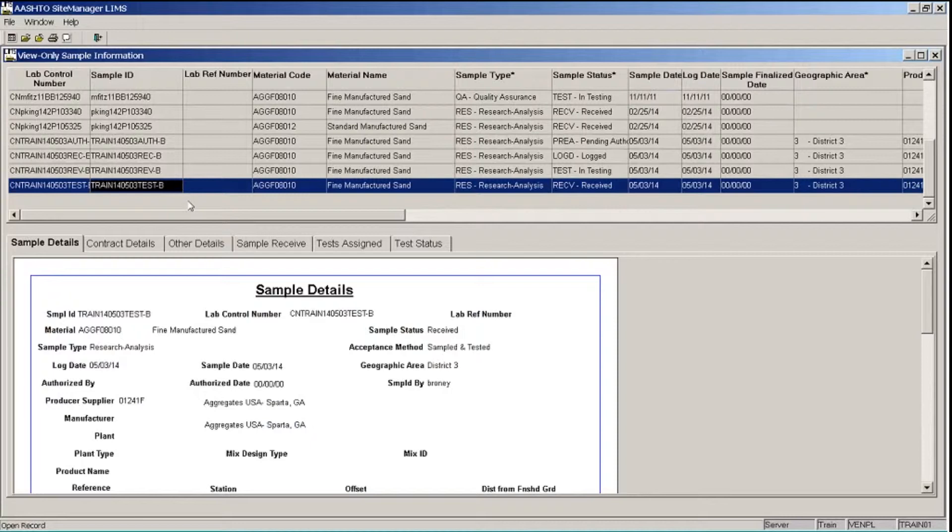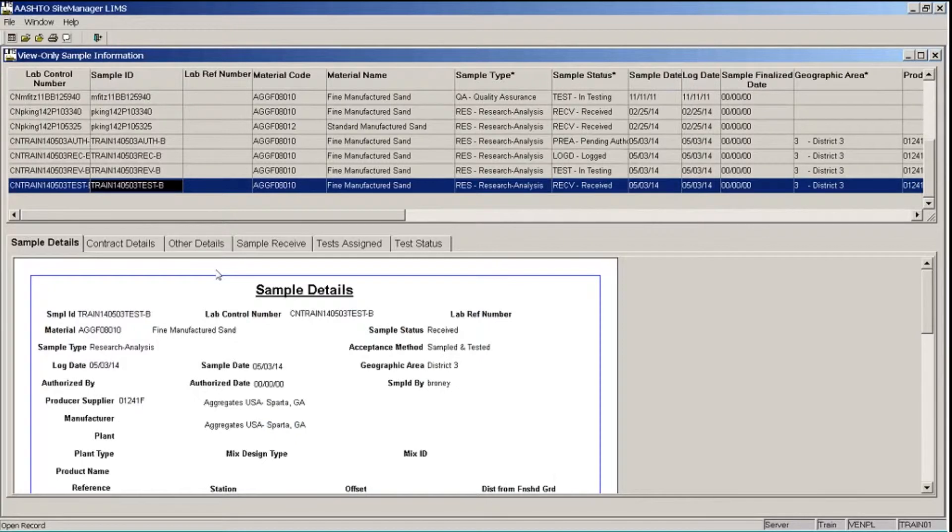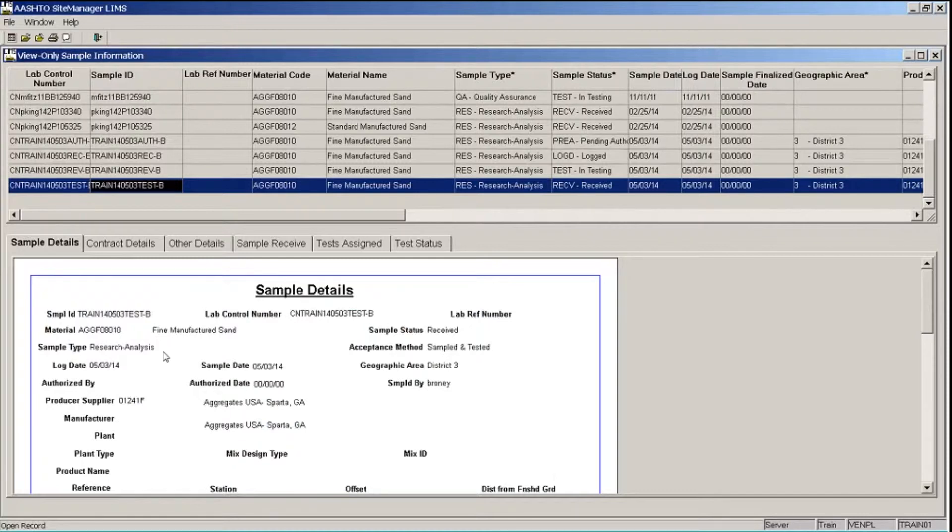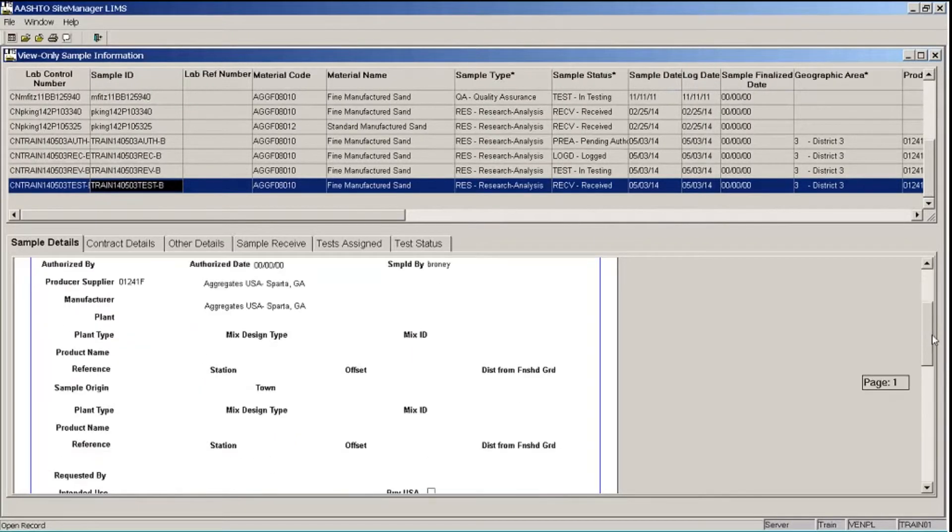So I'm starting on the Sample Details tab, which contains information from the Maintain Sample Information window, Basic Sample Data tab, such as the Material, My Sample Type, Acceptance Method, Producer Supplier, and if I scroll down, I can also see my represented quantity here.